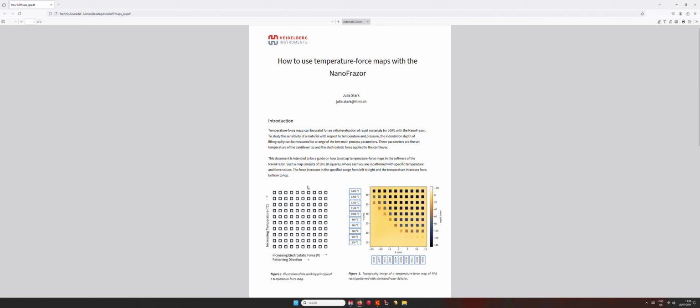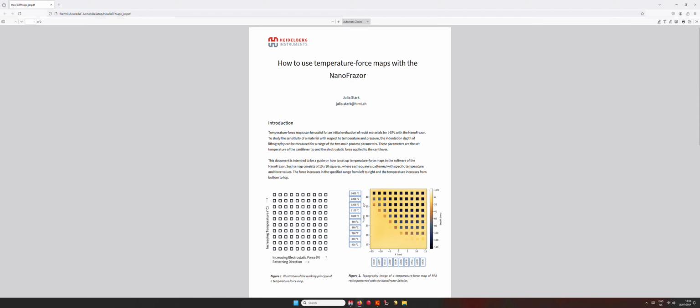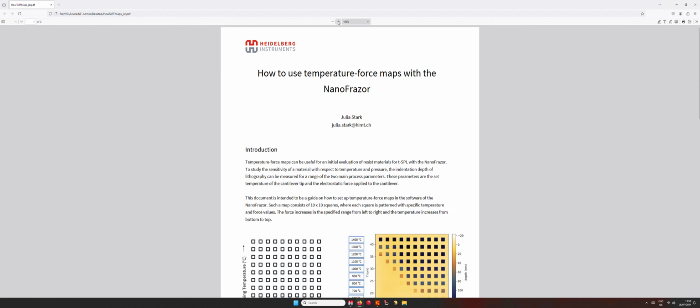Before starting the video, I would like to redirect you, in case you haven't watched yet, to the video that's related to temperature maps, to understand what a temperature map is, why it's needed and how to use it. In this video, we will discuss the specific case of a temperature map that is used together with a force map, which is a standard design that we import in the NanoFrazor. So it's good that you know how a temperature map works. But let's dive into this specific case.